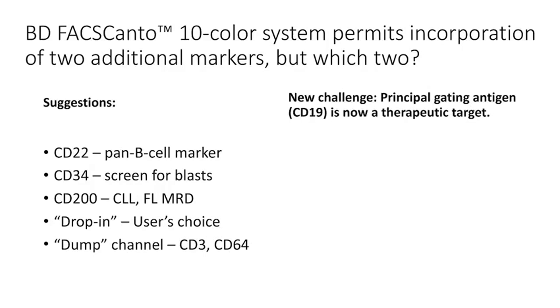Now, one thing that sort of guided our developing this is we have a new challenge, and that is our principal gating antigen, CD19, has become a therapeutic target. Next.